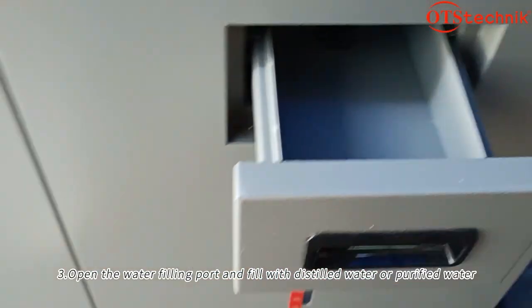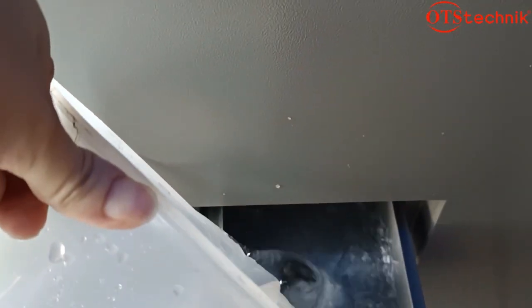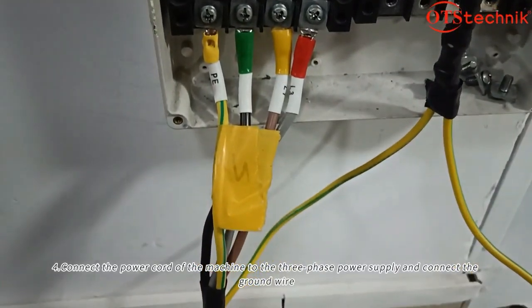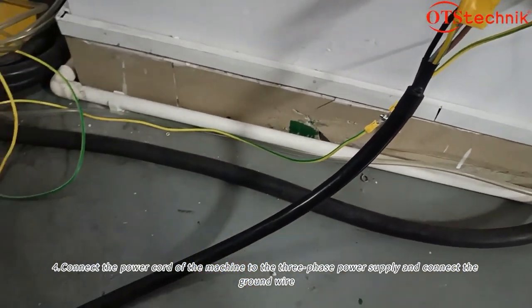Open the water filling pot and fill it with distilled water or purified water. Connect the power cord of the machine to the three-phase power supply and connect the ground wire.